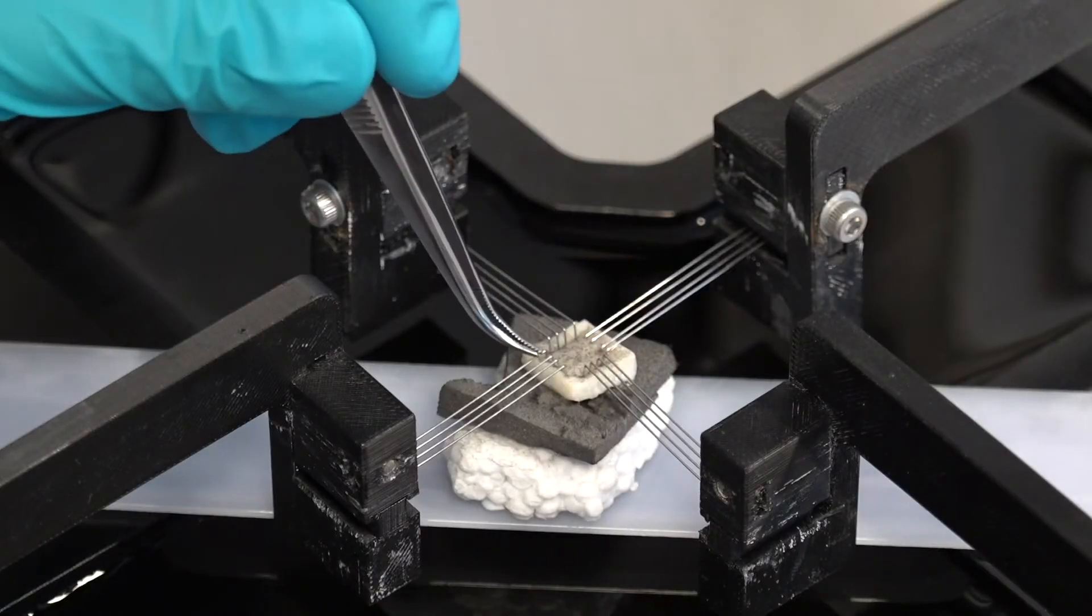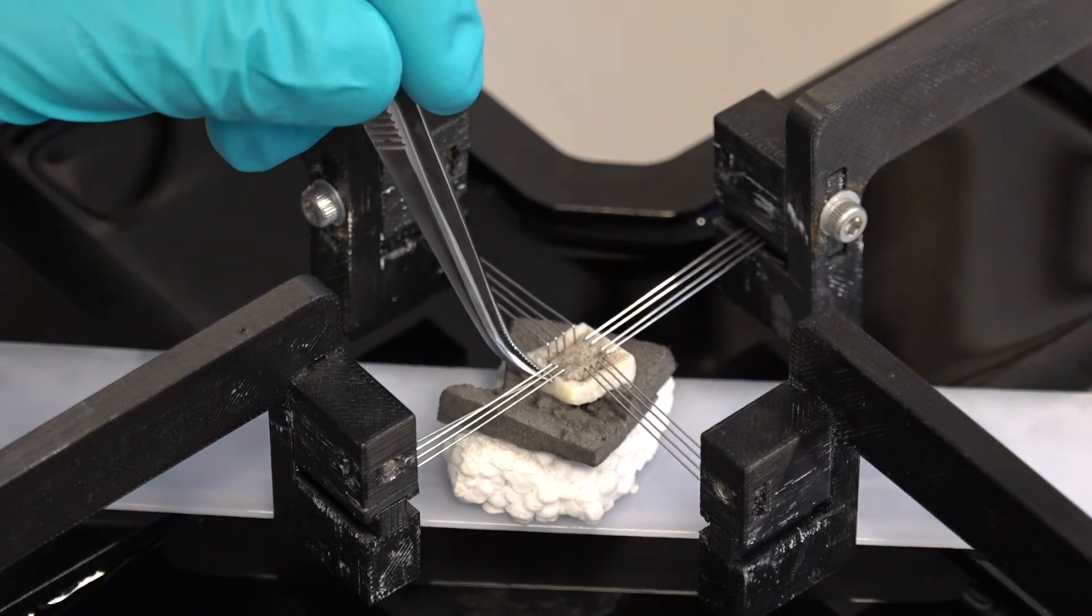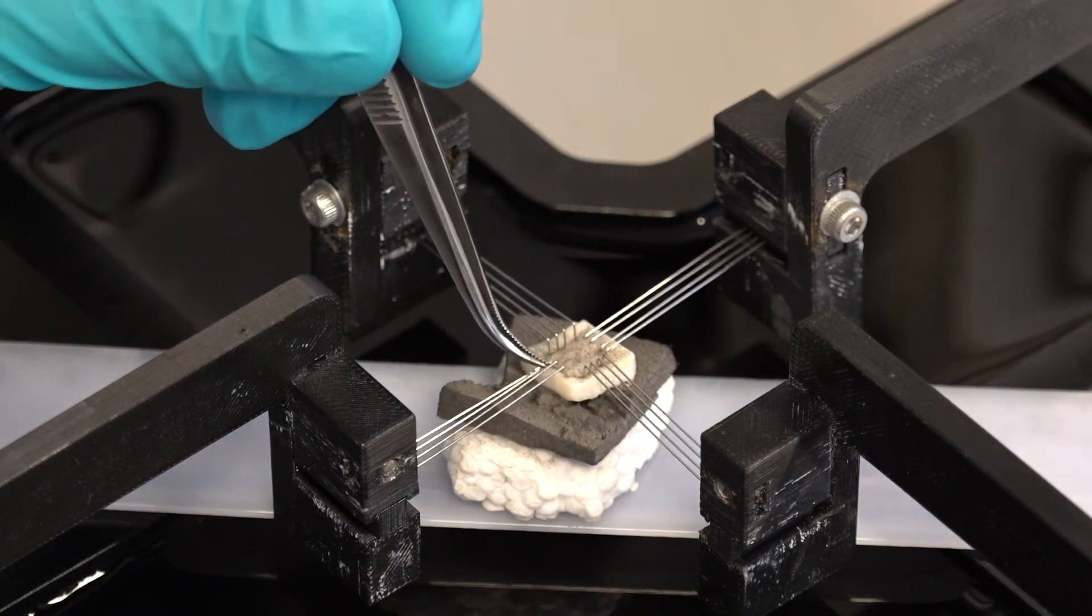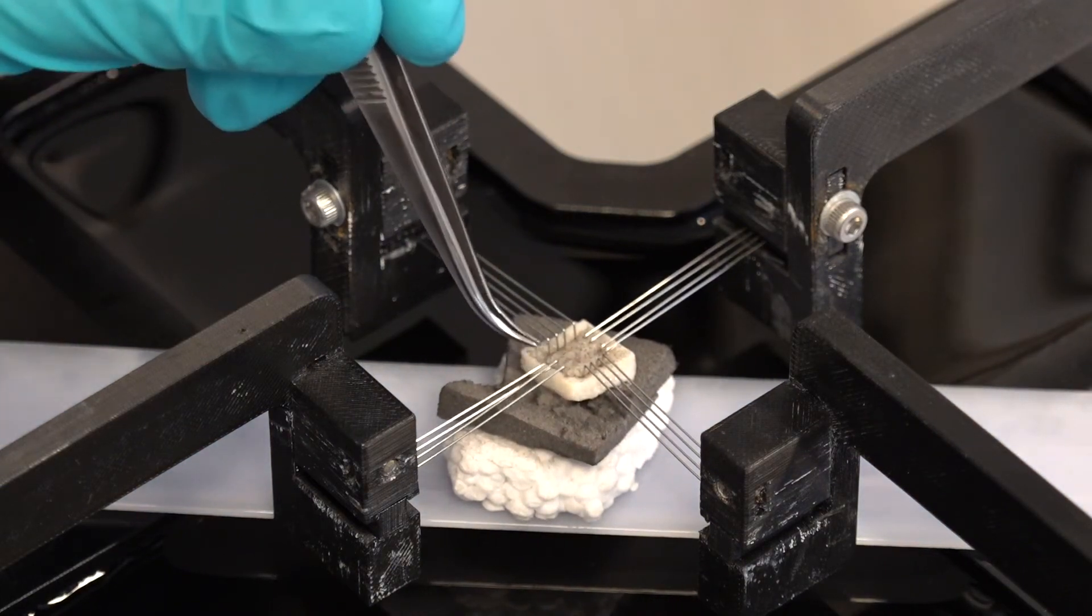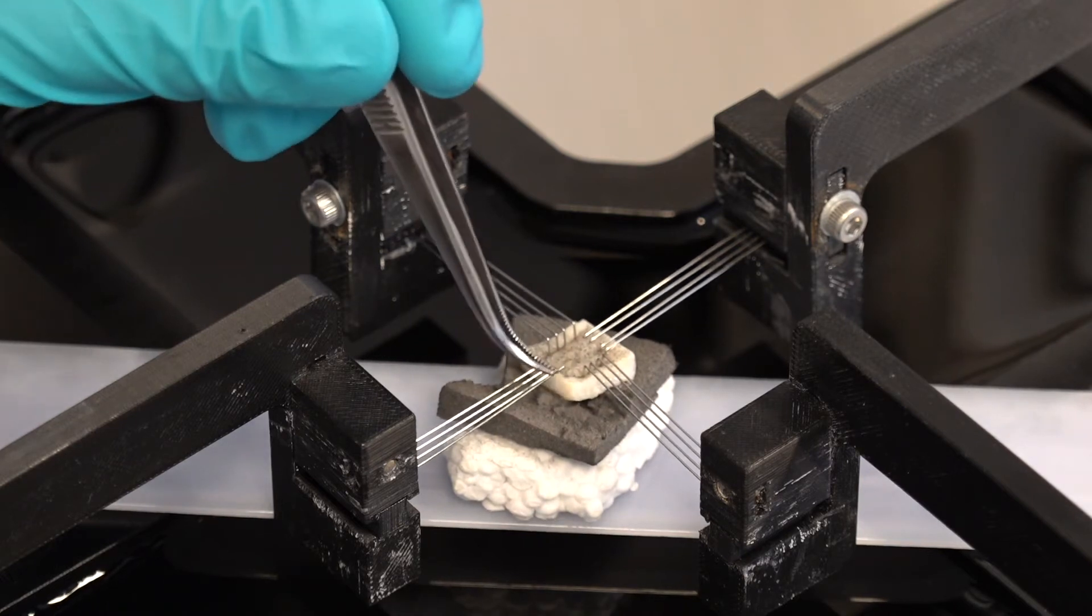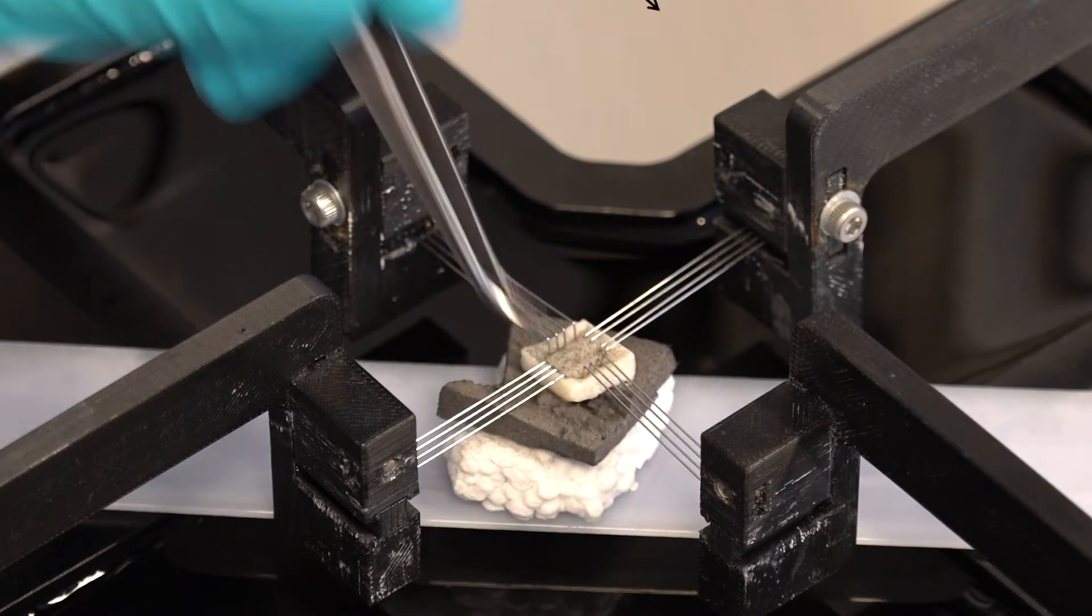When mounting the sample, it's important to align the sample's axes, and hence the axes of the material, with those of the device.